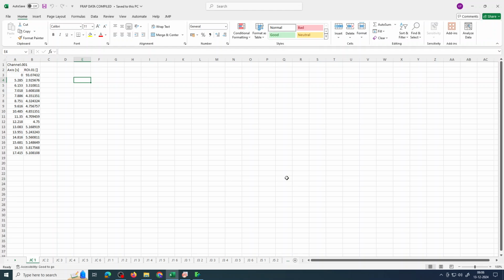So in this video we will discuss how we can model the FRAP data, that is the fluorescence recovery after photobleaching data, into a drug diffusion equation or a drug diffusion model. For that, first of all, this is our raw data. We need more data points in order to fit this data into a model equation, and for that we will use the concept of interpolation.